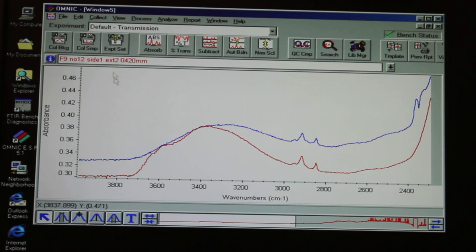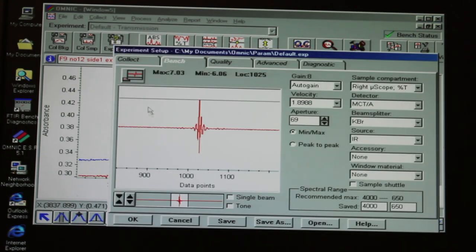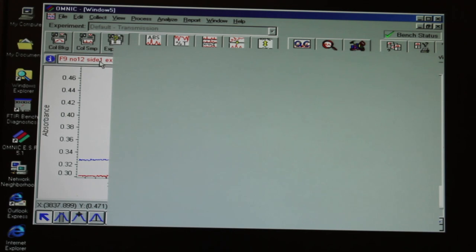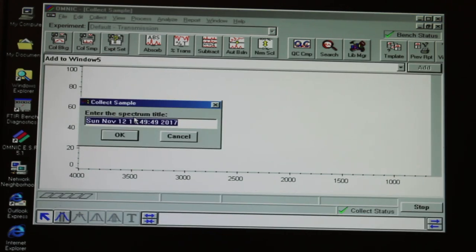To obtain a spectrum using the Omnic software, first click on Experimental Setup. This opens a window where you can see the interferogram from the instrument. You need there to be signal on that diagram in order to take a spectrum.